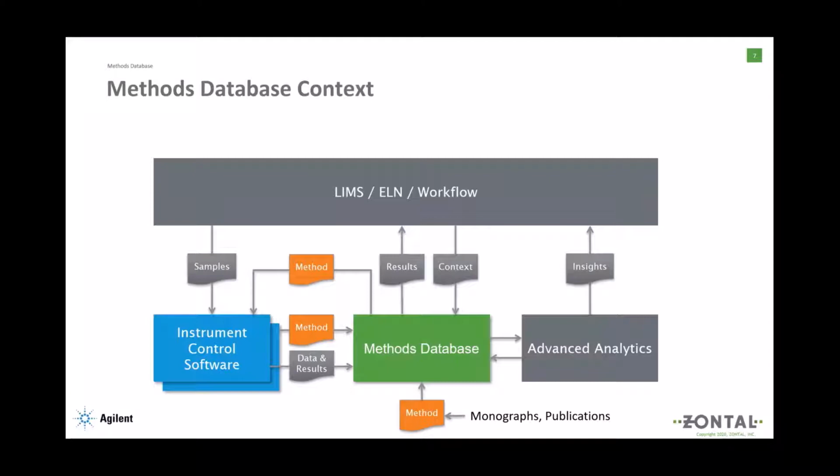Once we have all those methods captured, we can then enrich our data sets with data and results and additional experimental context in the end to generate new insights. And in the current setting, our understanding is that mostly LIMS or ELN systems would drive the workflow. So they would send a sample set to the CDS system together with the method selection and maybe some override of method parameters to kick off the run.